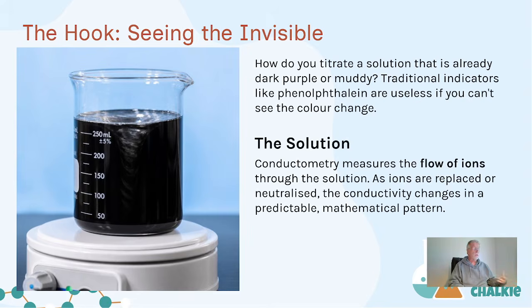Okay? Do these have any use? Absolutely. Let's say you were titrating a sample of river water to test whatever iron you're looking for, and it's murky. It may not be quite as dark as the beaker solution you see on this slide, but river water is not going to be very clear. Okay, so this is why we need this technique, and what it measures is conductivity.